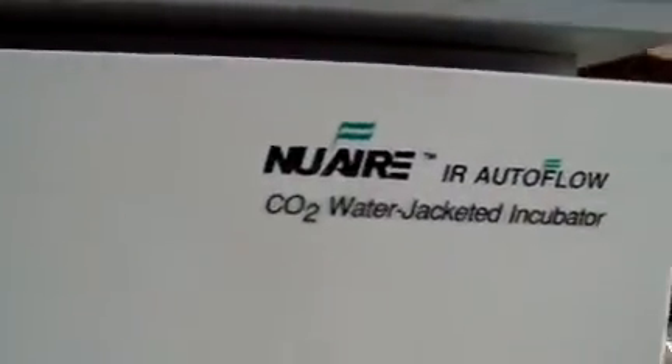Hey, it's Keith from DCSB Medical looking at a Newair Incubator. It's in good cosmetic condition, a little bit of surface rust there. It does have all of its trays, all of the brackets for mounting the trays, and the glass is all intact.